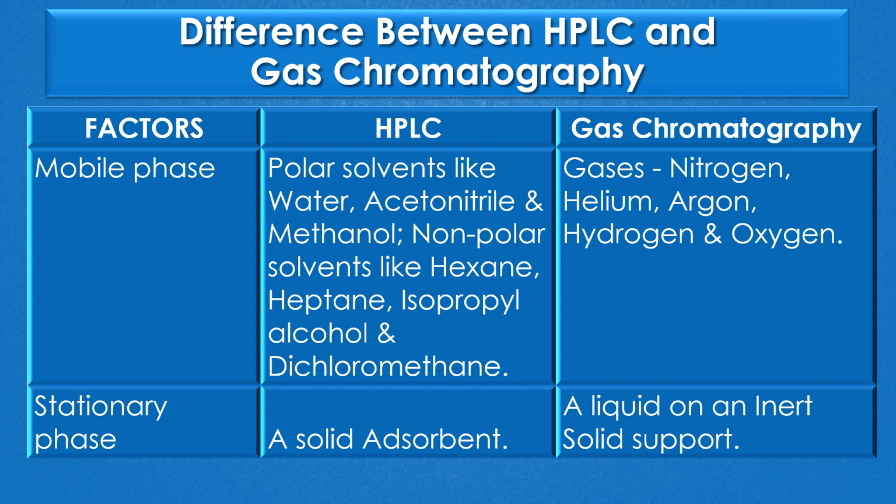The stationary phase of a HPLC is a solid adsorbent, and the stationary phase of gas chromatography is a liquid on an inert solid support.